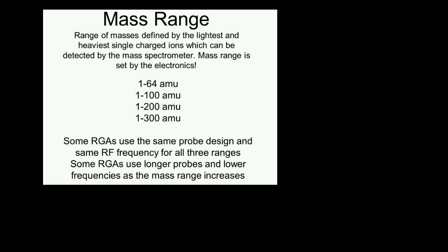So they have all kinds of molecules, typically organic molecules, and they're trying to quantify them or look at their fragmentation patterns or whatever it is, and they need the entire range. Of course, nowadays in the semiconductor industry, chemistries are getting more and more sophisticated, with lots of precursors being these organometallic compounds and so on. So the use of higher molecular weight RGAs is becoming more and more popular.